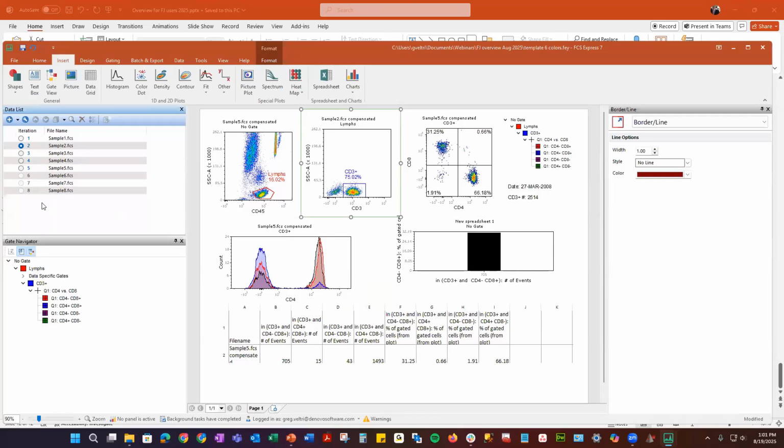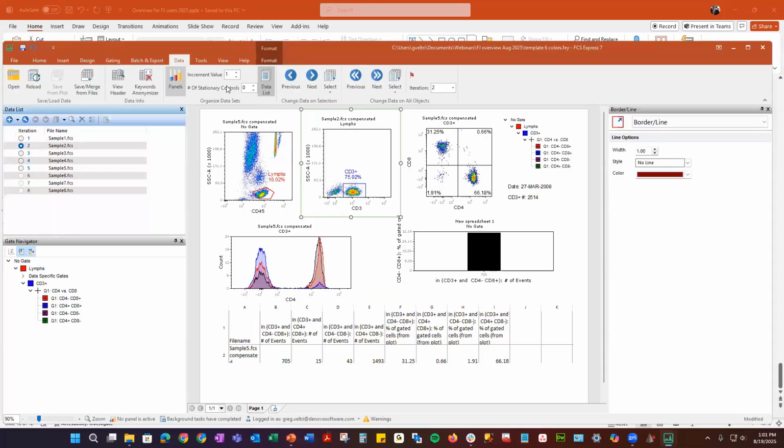Usually the gray out means that you have multiple data samples in there, and so it's only going to batch what's blue and not gray. So what I would first do is look at your layout and see if you did that. If you did that, then maybe you need to think about how you grouped it, right? That goes back to what I was talking about in the panels or the increments of how many you are putting together, right? So if I do this, 1 and 2, and then 3 is grayed out. So it may be something like that. Okay.